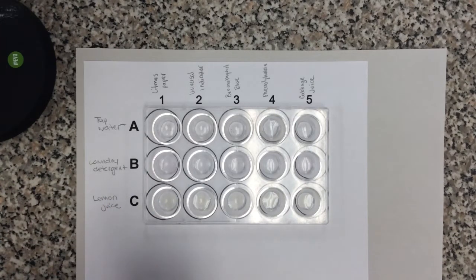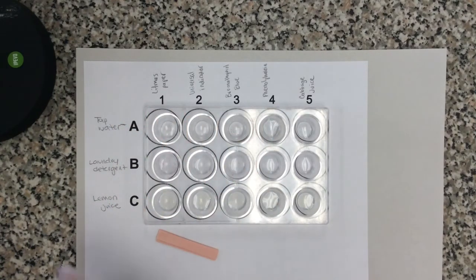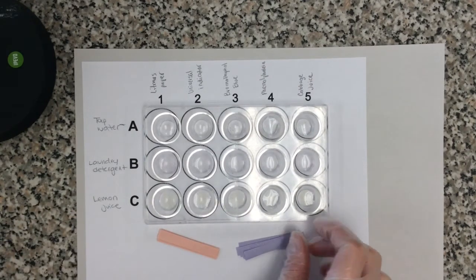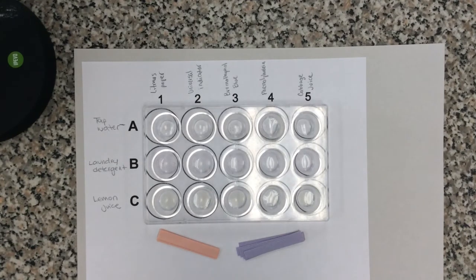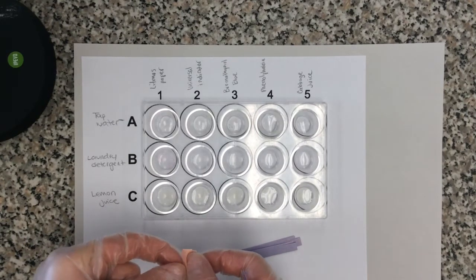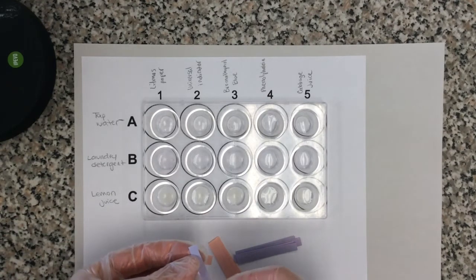So I'm going to grab some of my red litmus paper and my blue litmus paper. Now, the trick to learning about litmus paper and whether something is an acid or a base is that whenever it is an acid, your litmus paper will turn red. If it's a base, your litmus paper will turn blue. And if you put both colors in and neither of them changes, you know that it is neutral. So we're going to go ahead and test each of these right now.